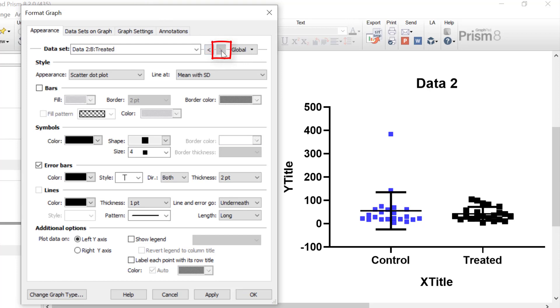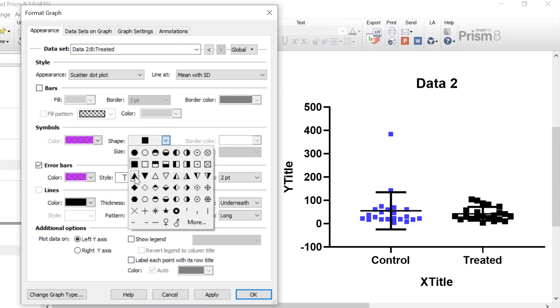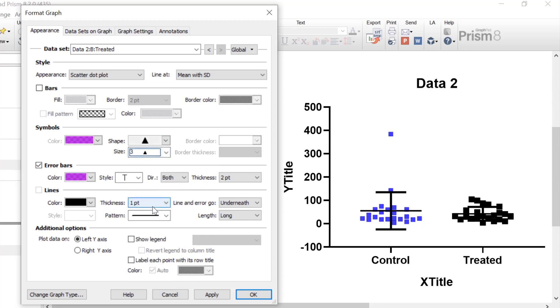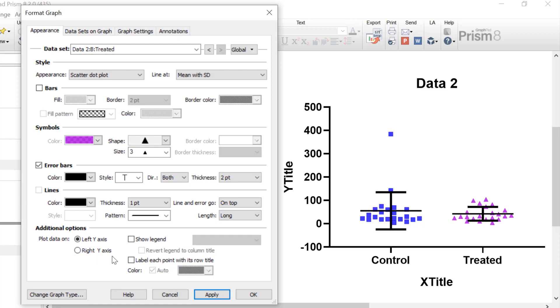I'll toggle to the treated group and alter the changes there as well. I'll change the symbol colour to a slightly transparent purple, change the symbol shape to a triangle, reduce the size to three, leave the error bars as solid black, set the line and error to go on top, and click apply. At the very bottom under additional options you have the option to plot an additional y-axis or a figure legend. For this particular example I wouldn't advise showing a figure legend because the group names are plotted underneath each column, so it wouldn't be sensible to include one here.